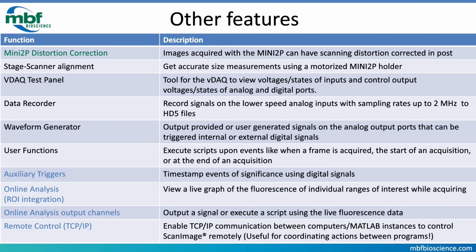We also have online analysis and output channels, which allow you to see the fluorescence over time plots for ranges of interest within the collected frames while you're collecting them, and also output signals or execute code based on the live fluorescence traces.